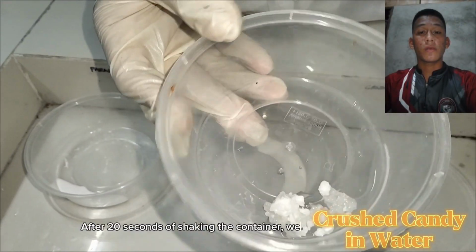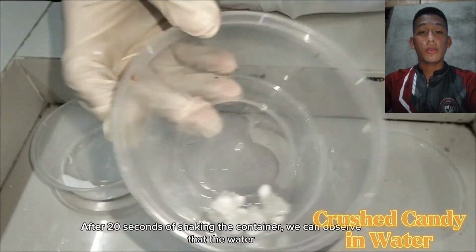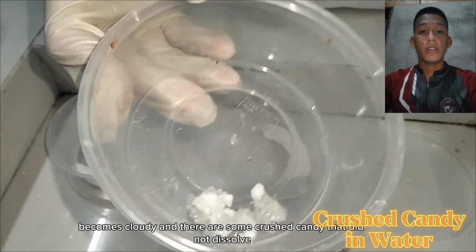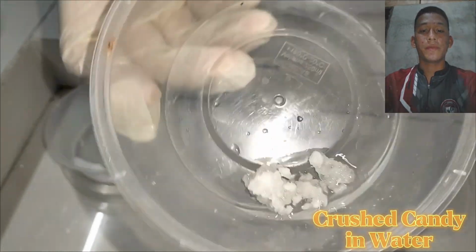After 20 seconds of shaking the container, we can observe that the water becomes cloudy and there are some crushed candies that did not dissolve.